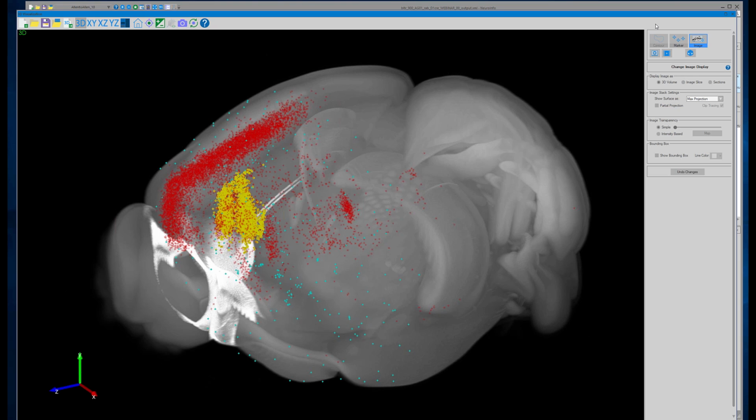Okay. So the real slow part of this process is the imaging, and that takes, as I said, 3 to 4 hours times 10. But that's all automated. And then the processing that we do in NeuroInfo, for the BrainMaker part, where we do the registration and all, typically takes about an hour.